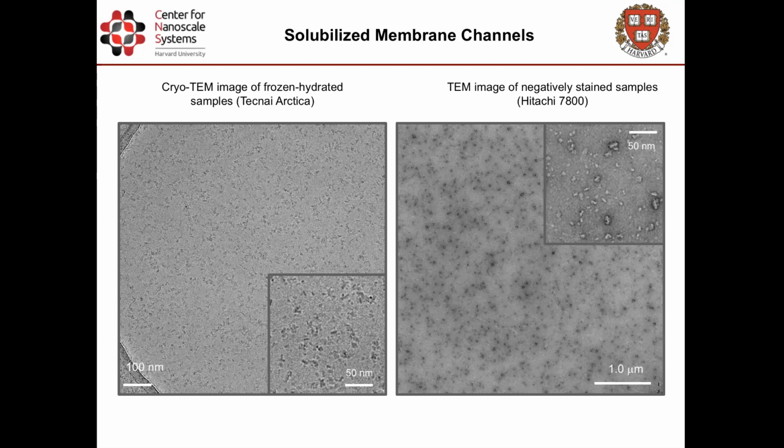Cryo-EM will really be applicable for non-structural projects when we have deep learning software which will be able to analyze huge amounts of data and make sense of them. I don't know how you teach a machine to look for something when you don't know if it's there or not, or might be something different, but I believe we will get a solution to that in 10 years.